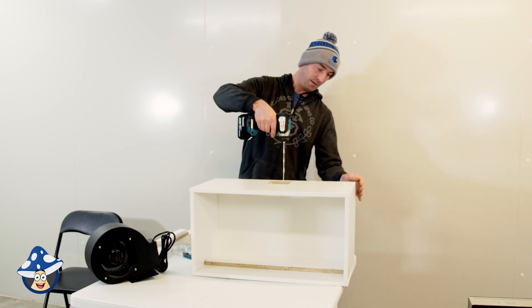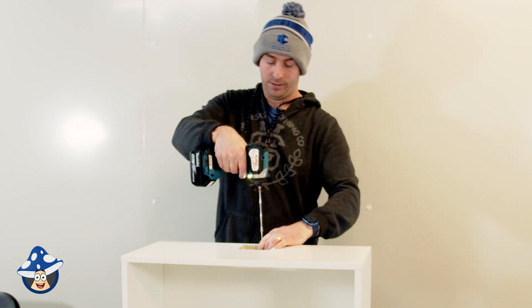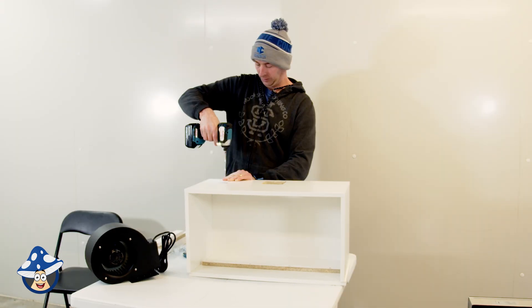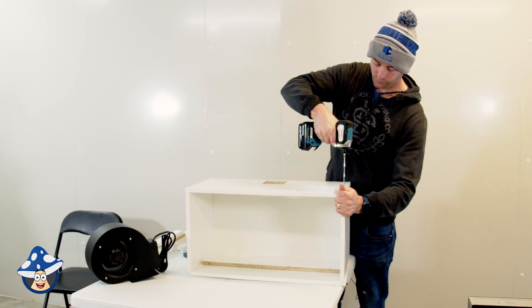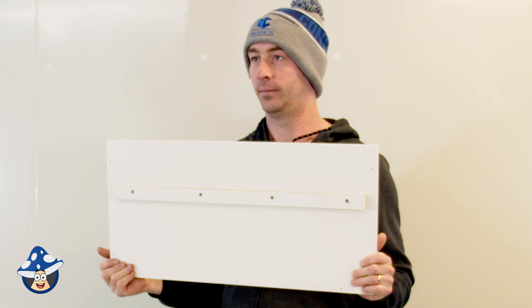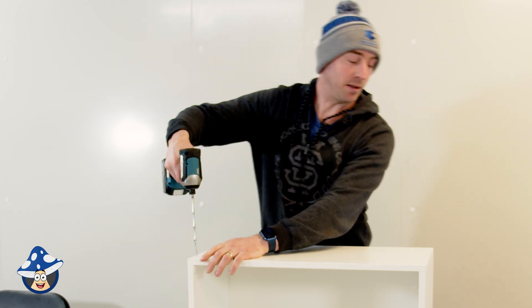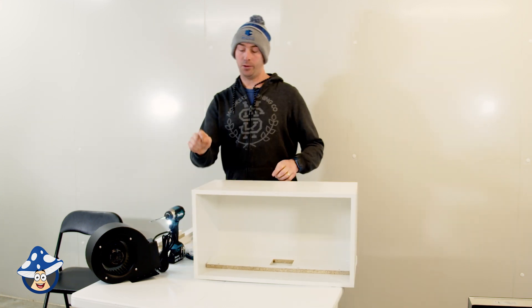Whenever you're screwing, just make sure you hold both bits together to ensure everything is lined up nice and right. Go down until it's nice and flush. Just make sure you've got the right long screws for this part, and with every screw make sure everything's lined up. Make sure the smaller side is to the front and you're paying all of this to the back of the unit. Make sure all the holes have a screw in them.